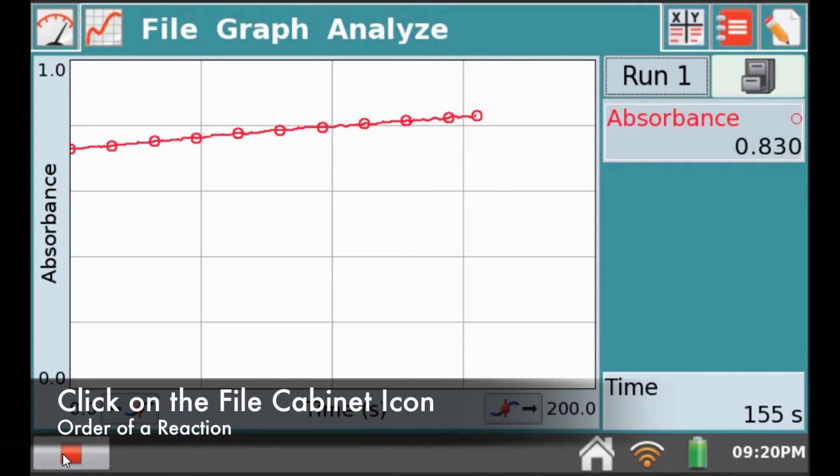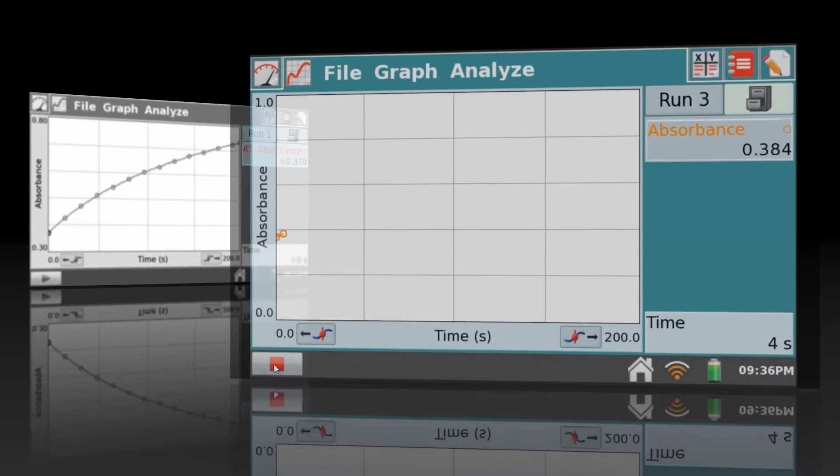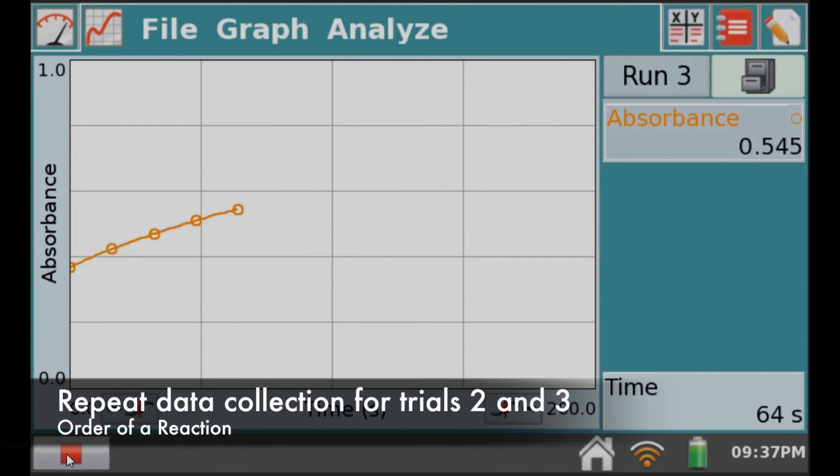To collect data from run 2, just click the file cabinet icon on the top right corner. Now repeat the experiment for the different runs.